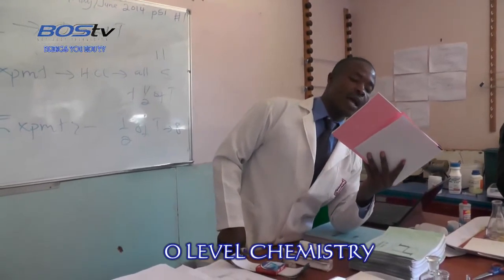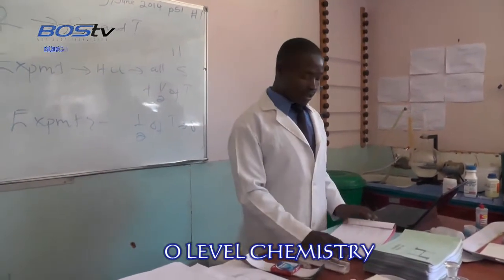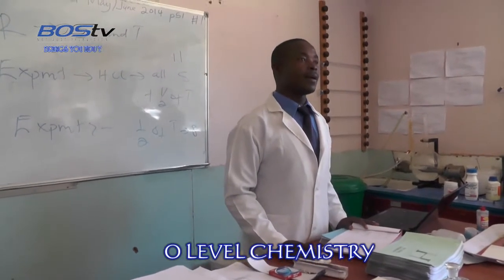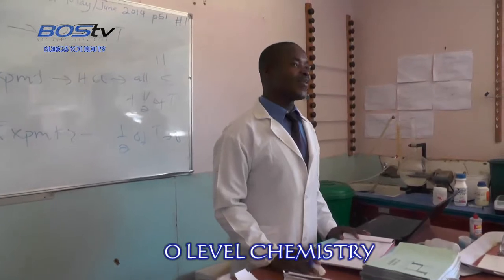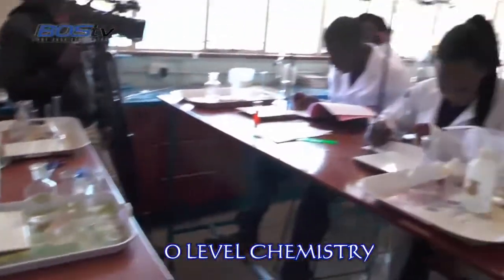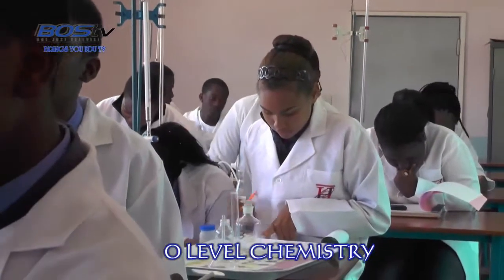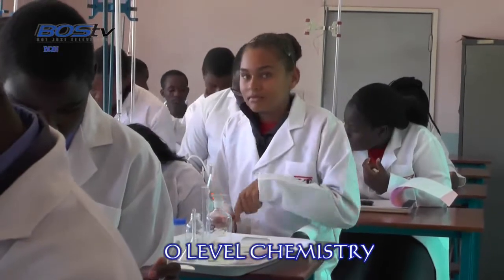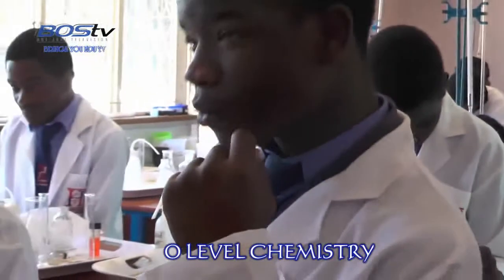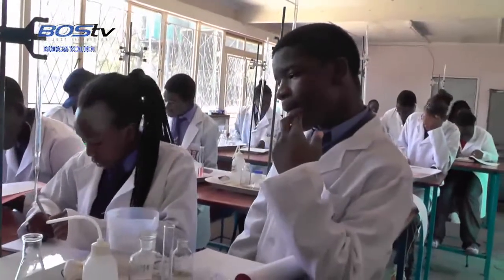Compare the volumes of hydrochloric acid which reacted with substance S and T. Let's compare the volumes which reacted with S and T. You have the volumes. All right, how much of your HCl reacted with S? You are still working it out. All right, who has finished? Anyone else who has finished?